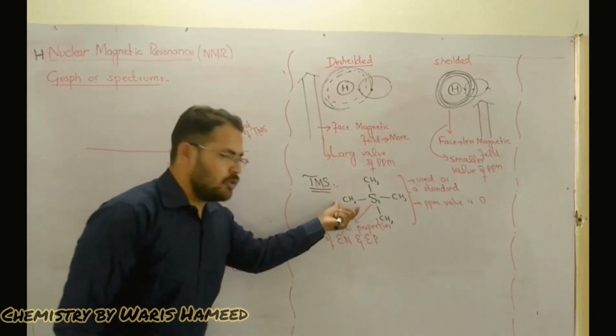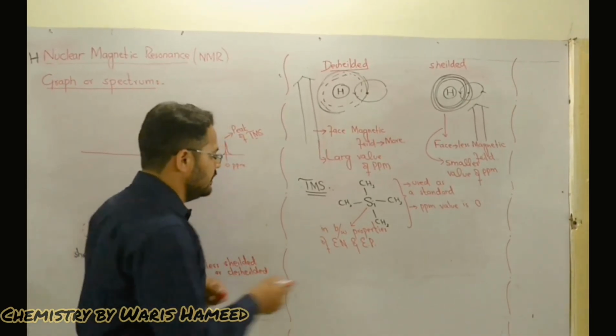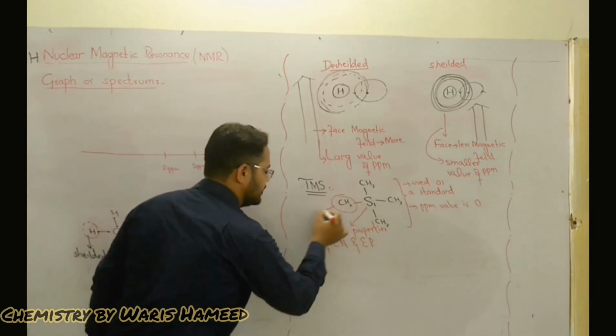In this case, protons are shielded. These protons are shielded.